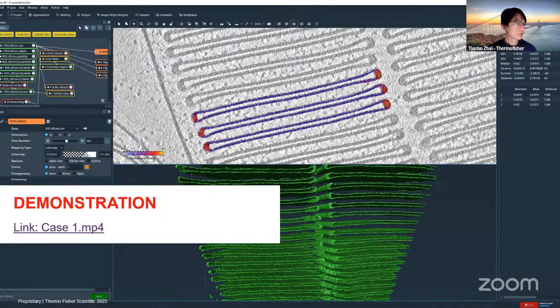And it went through every single imaging data. Then based on the probability, it will classify the pixel as whether that's a structure of interest or not. So those that are classified as true to be a structure of interest are highlighted in green.